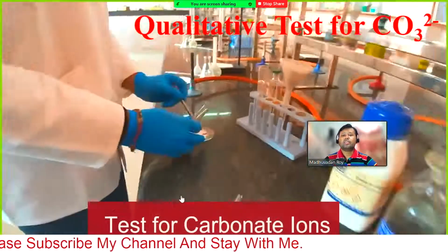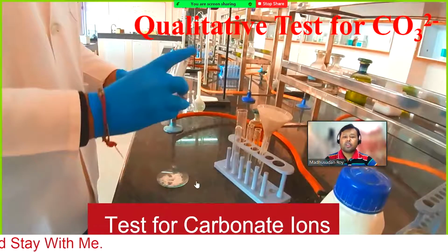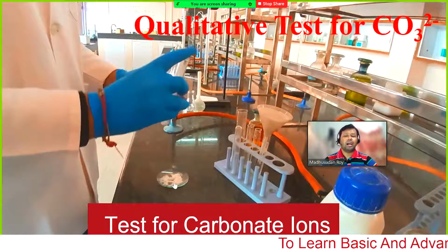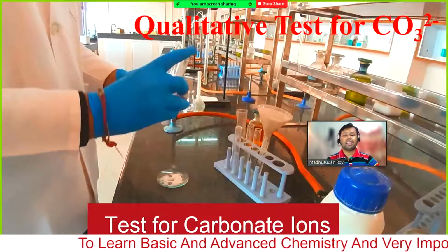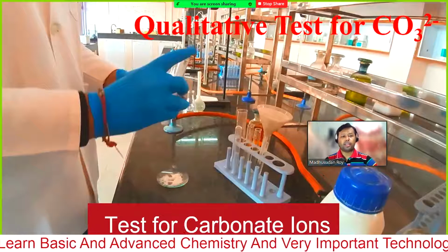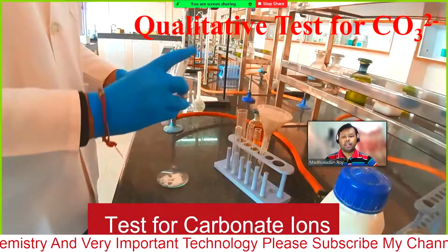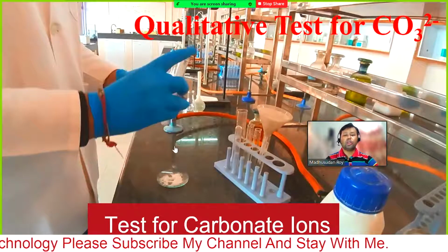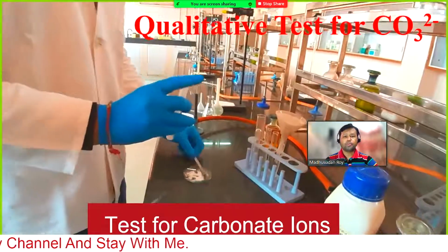First let's see taking the carbonate salt. This is the carbonate salt, and we are taking it into a test tube using a spatula. In most cases carbonate salts are white, or more normally we should say colorless, however not colorless exactly, because white is a combination of 7 different colors, so we will say this is white. Anyway, test for carbonate ions: first take the solid carbonate salt into a test tube.